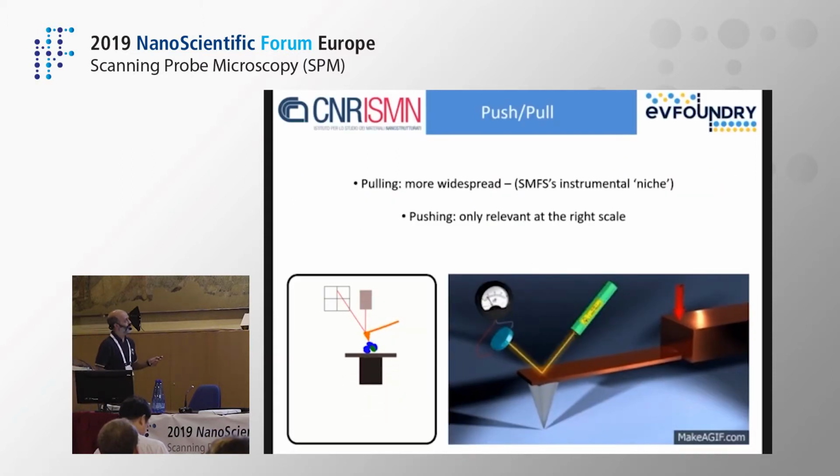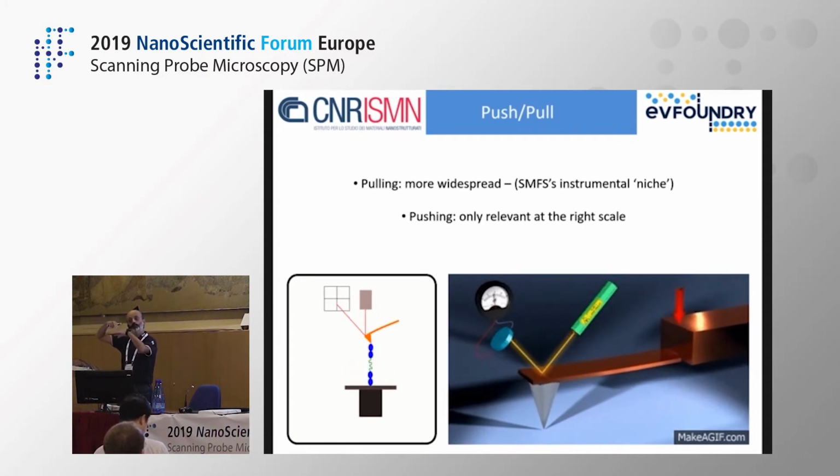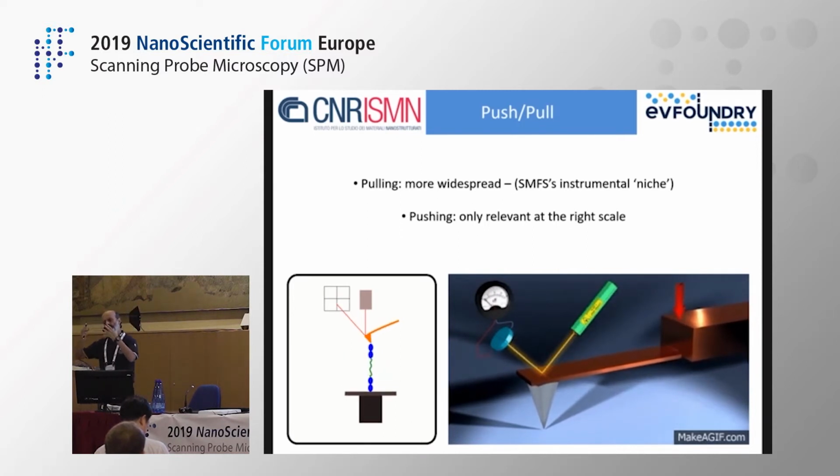The audience does not require an explanation of what mechanical measurements mean, but just to give you a hint, I will focus mainly on this kind of measurement where we indent a sample and objects in order to map their compliance, or in general to obtain its mechanical properties.